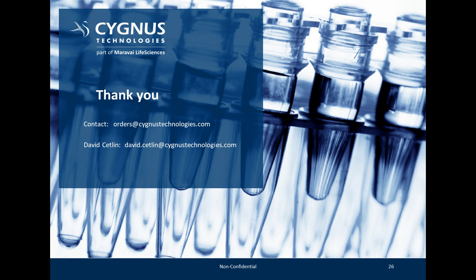Probably the best use of our kit is you can use it to benchmark MVM, especially with historical data. But the best way to utilize this is for trending purposes, like what we saw with the GSK data, to map out the conditions and the parameters where you might get poor clearance. That's the best and most proper use of the kit.